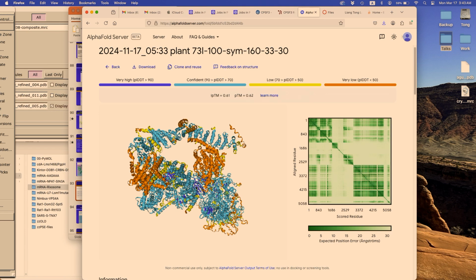There, the confidence is probably not as good as protein-protein or protein-RNA interactions. But at least it gives you some ideas. Okay, so any other questions? Oh, okay, PyMOL, are you all familiar with PyMOL? So what you do is you can download right here. So let me do that.